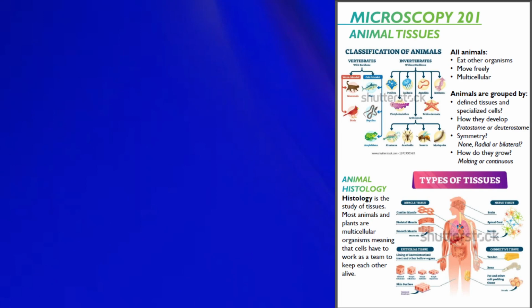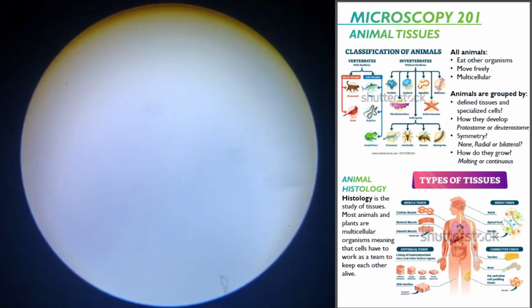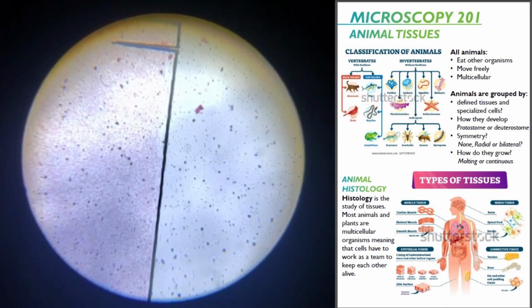Let's look at our scope. Oops, scope is off again. Gotta fix that. That's not what I'm looking at. That's what I'm looking at. Okay. All the way down. I slowly bring it up. I'm turning the coarse, the fat adjustment knob. Oh yeah, already. Alright. So that's the line of that pink patch.